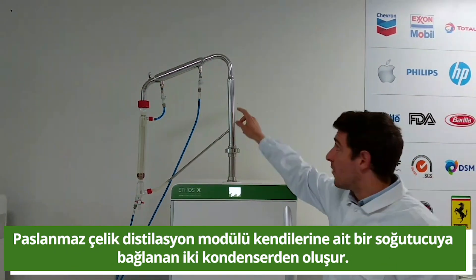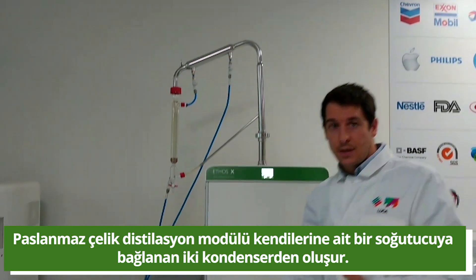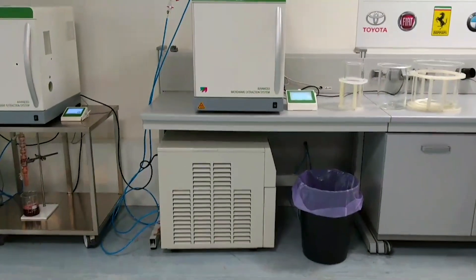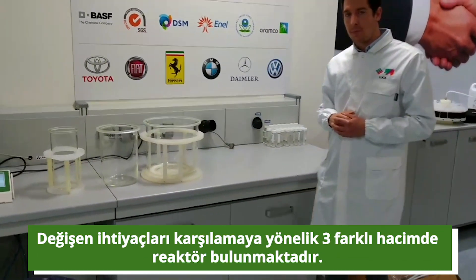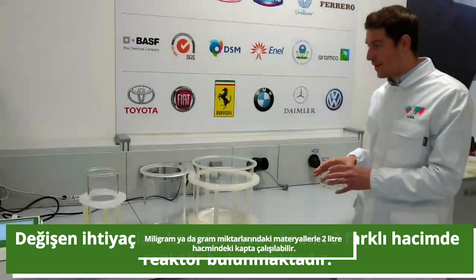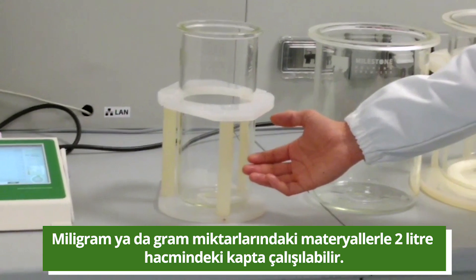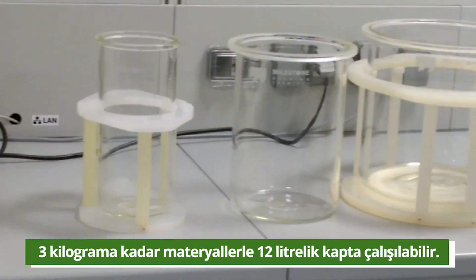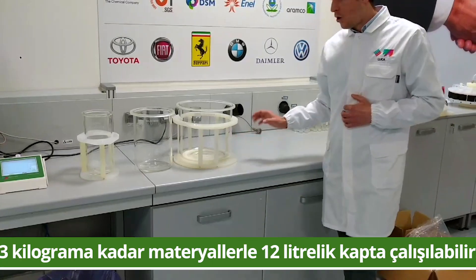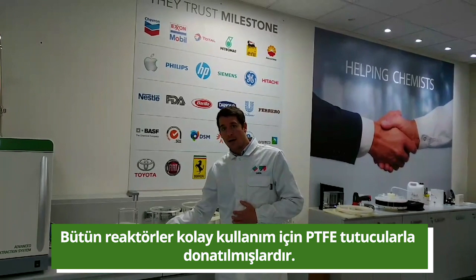The stainless steel distillation module is made up of two condensors which are connected to a dedicated chiller. Three reactors with different volume capabilities are available on the market to meet the most varied requirements. We can work from milligrams of material in the 2-liter vessel up to 3 kilograms of material in the 12-liter vessel. All reactors are equipped with a PTFE holder to allow easy handling.